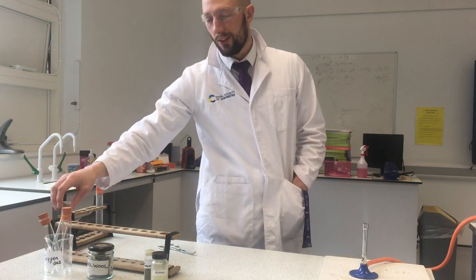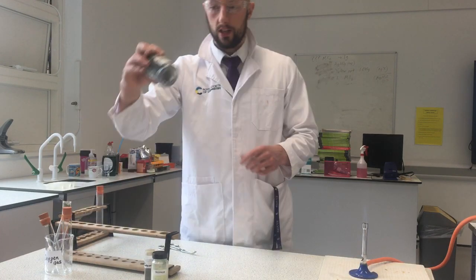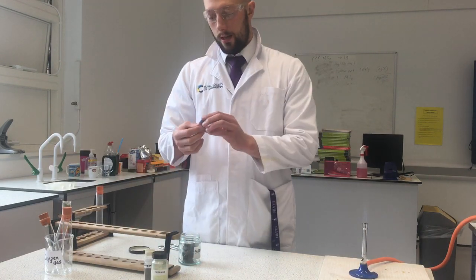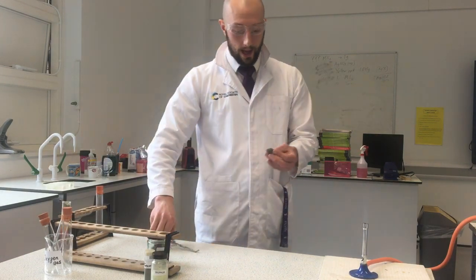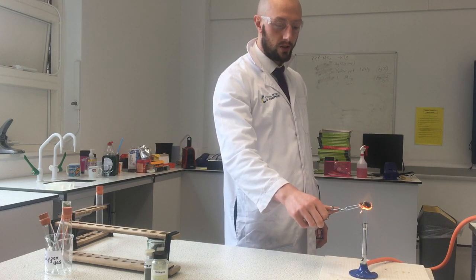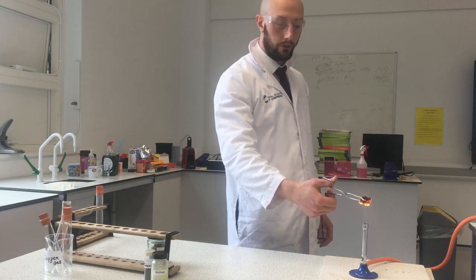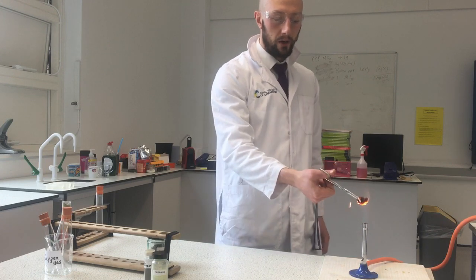You can probably predict what's going to happen when we go to oxygen. We are going to see something a little bit more interesting. So I'm going to take some of my steel wool first. Now that was reacting with sulfur. Reacting with oxygen, we can just use the oxygen in the air. So I'm going to get my steel wool in my tongs and hold it in the Bunsen flame. Look at that, straight away we can see it lighting up as the steel wool burns in oxygen. That's quite a good reaction. But I reckon we could make it better.